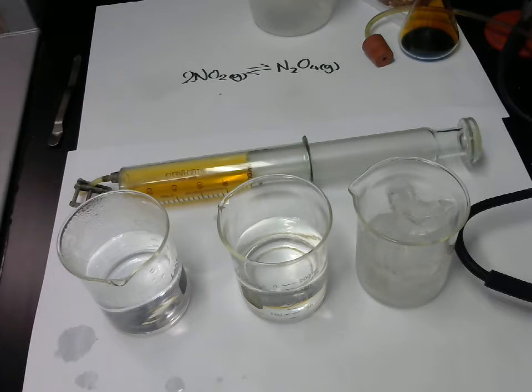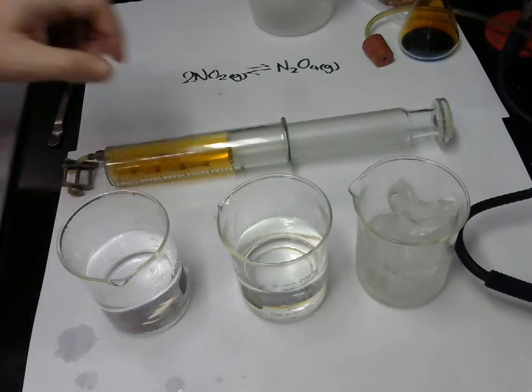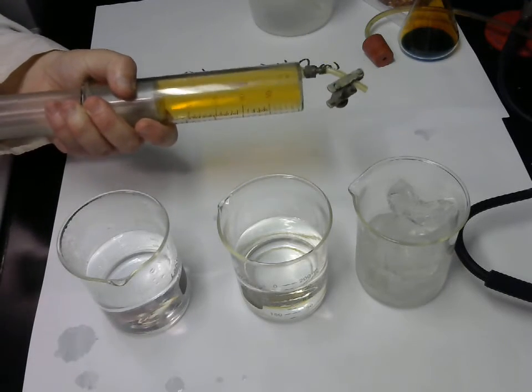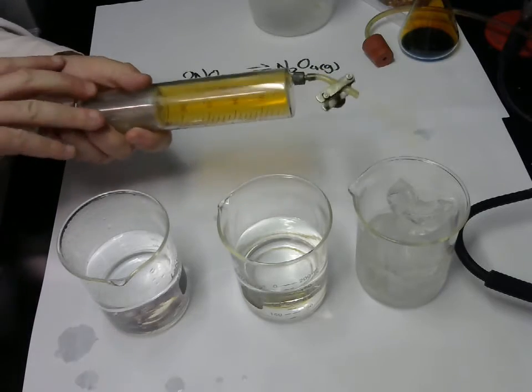The first one I'm going to do is change pressure. What we're going to observe is, if I increase pressure, I'm putting the particles closer together. So initially it will get darker anyway because the concentration increases. So what we want to do is make the change, hold it there, and see if it fades or gets even darker. Is that in my field of view there, guys? Okay, so I've got a benchmark using the white in the background to see what colour it is. Remember, I'll push it in, which will increase concentration, so initially it will get darker anyway. But then I'm going to hold it there and we'll see if there's any change.